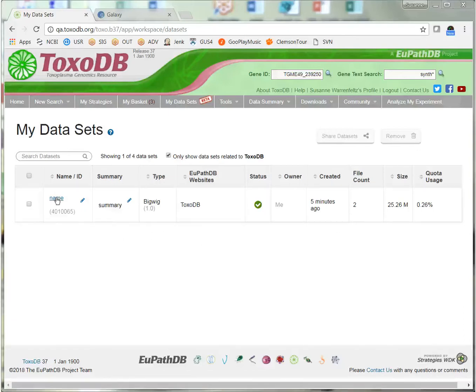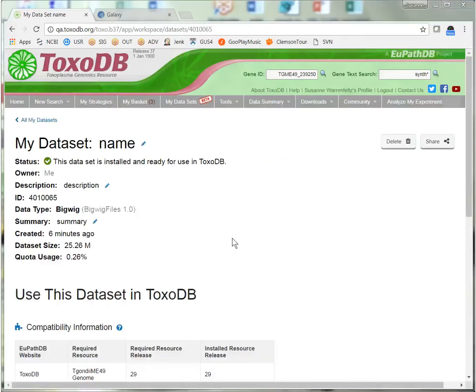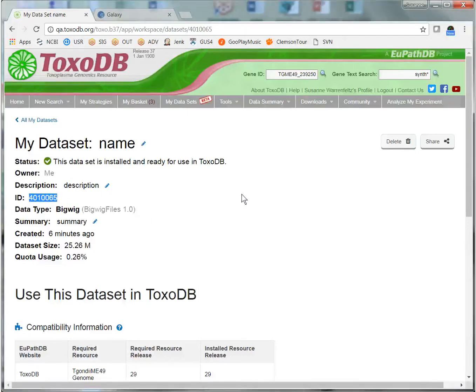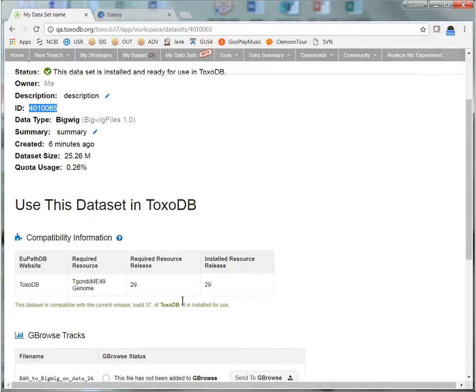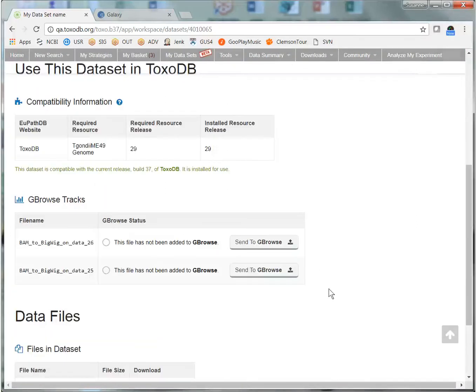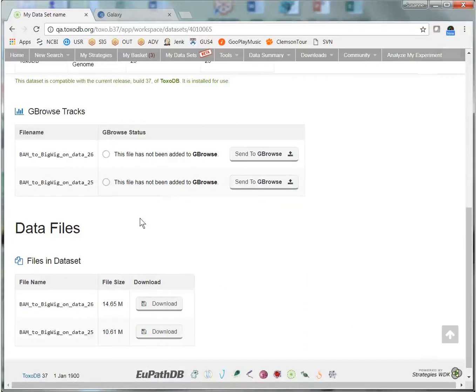The first column here serves as a link to the dataset record with specific information about this dataset. There is some general information at the top of the page, including a unique identifier for this dataset. The table below indicates which genome version your data is compatible with, and below that is a list of GBrowse files that we just transferred.